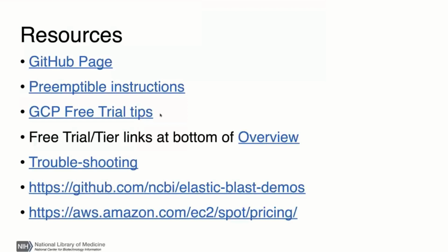Okay, so then another question is about, I'll just read it to you because it's got a lot of detail in it. It sounds like ElasticBLAST is an alternative to setting up the BLAST Plus executables in the cloud, say with Docker. Is that true? Are there programs or options we'd be missing if we use ElasticBLAST? Yes, I guess you can think of it as an alternative. It makes it simpler to set up. And you could use Docker, or you could also use just the BLAST Plus command line binaries, which I have the impression a lot of people do in the cloud because it's just a Linux binary.